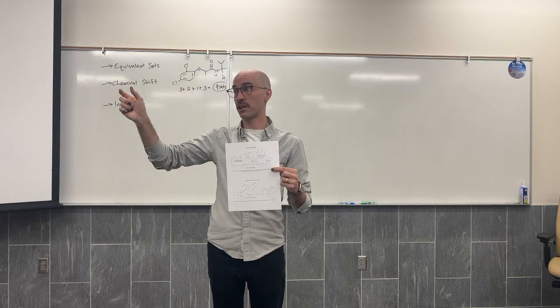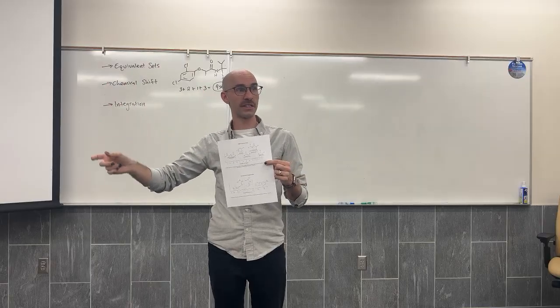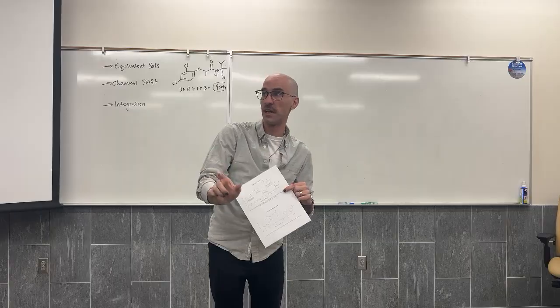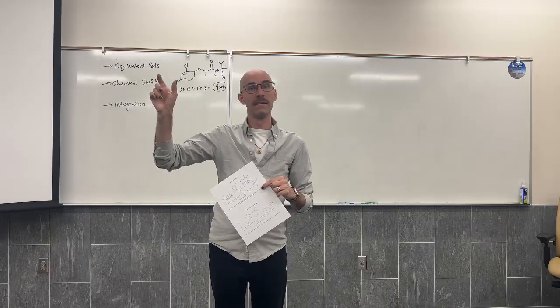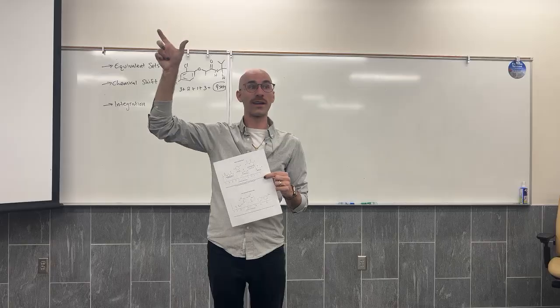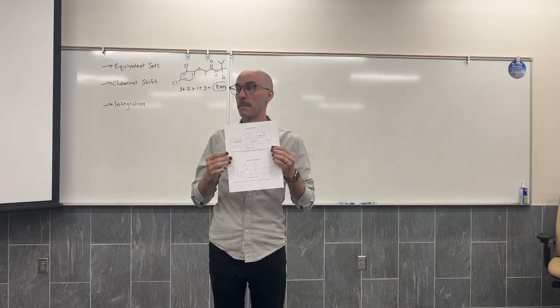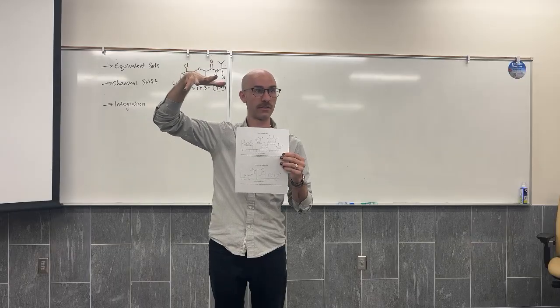His document is several pages long just for proton NMR because it tells you where to find the signal from a CH3 if it's next to a CH2, where to find the signal for a CH3 if it's next to a CH, where to find the signal for a CH3 if it's next to an O, next to an N, next to a Cl, next to an aromatic ring. It gives you an incredibly detailed view of where you can expect to find every signal. Mine takes a much, much more broad perspective.